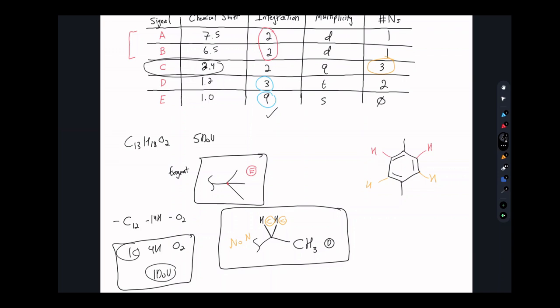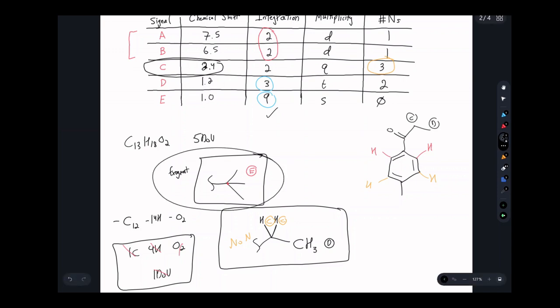We still have a DOU and a carbon, so let's start making assumptions. It's good we have to make them at some point, but make sure you're paying attention to when you're making them. It's possible that there's a carbonyl connected to this benzene ring. Then that would be connected to this fragment, which would contain HC and HD. Cool. What did that leave us with? Well, it handled our last DOU, it handled a carbon, and it handled one of our oxygens. We also handled our 4 hydrogens here, so all that's left is 1 oxygen. And a possibility for that, considering that the only fragment left is this terbutyl group, is that we could put the oxygen here and a terbutyl group like so.